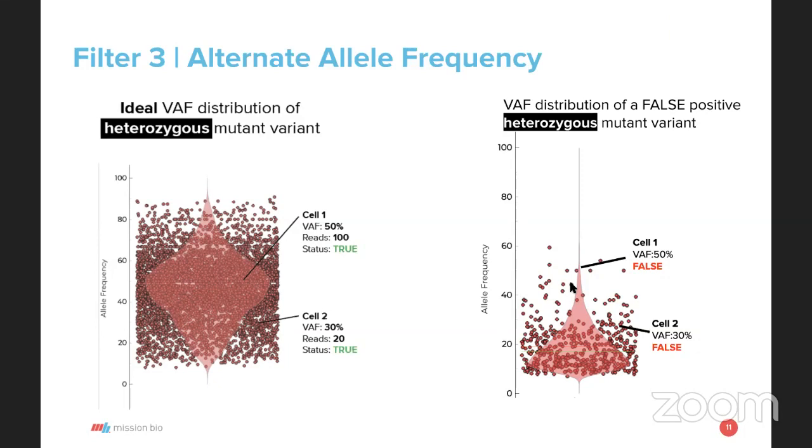Emma, is there a recommendation for how many cells you would want in this graph in order to feel confident in the value? How many cells? It would all depend. It is sample by sample, especially when you work with multi-sample. Imagine that you are looking at a very important mutation, and in diagnosis you have this distribution, and then in remission you have 3 or 4 cells.